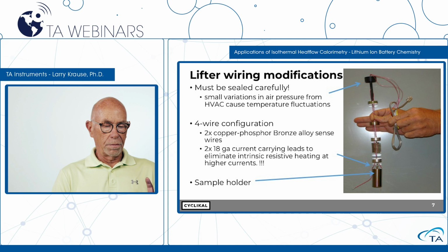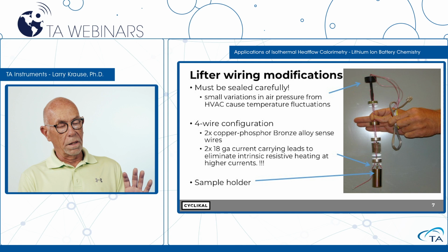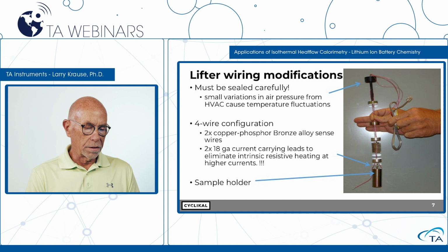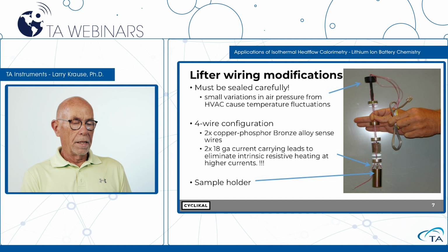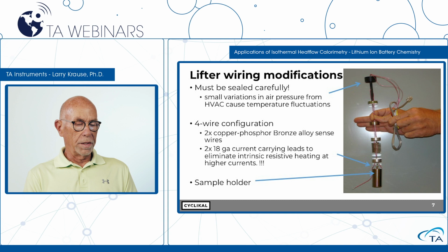So to make a long story short, what we found was anytime a piece of HVAC equipment would come on, or even when somebody walked in the door in the room, we would see this perturbation of the baseline. And what turned out to be is that we did not seal this shunt very well. The sealants that we used did not adhere to the stainless steel surface very well, so we moved to a different type of sealant. We now use a Torr Seal, which is an epoxy heavily impregnated with inorganics. And that wets the surface of the stainless steel very well, and it makes a wonderful seal, and we resolved our baseline issues and returned to the noise level that the instrument came with.